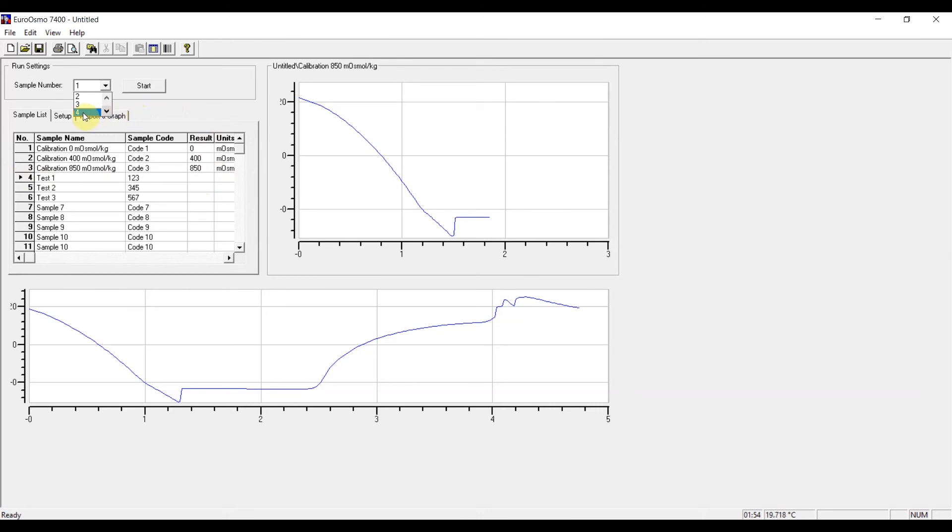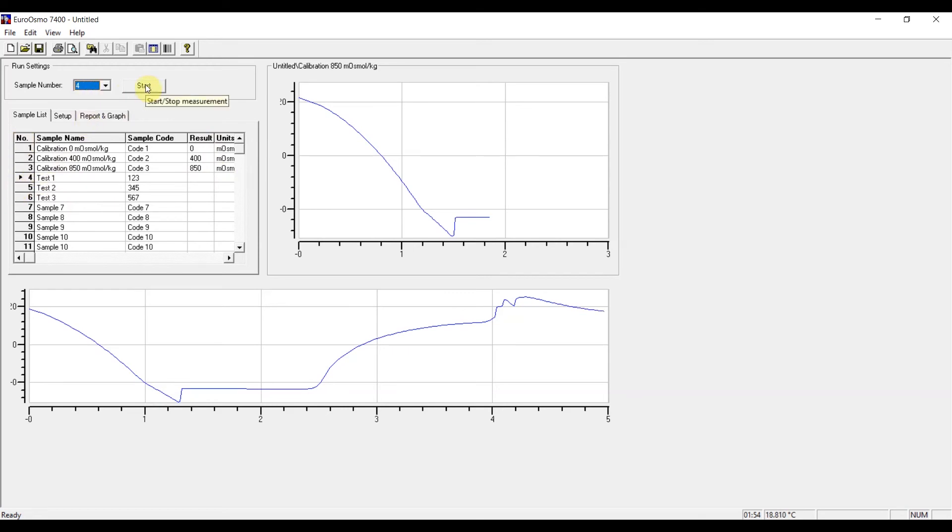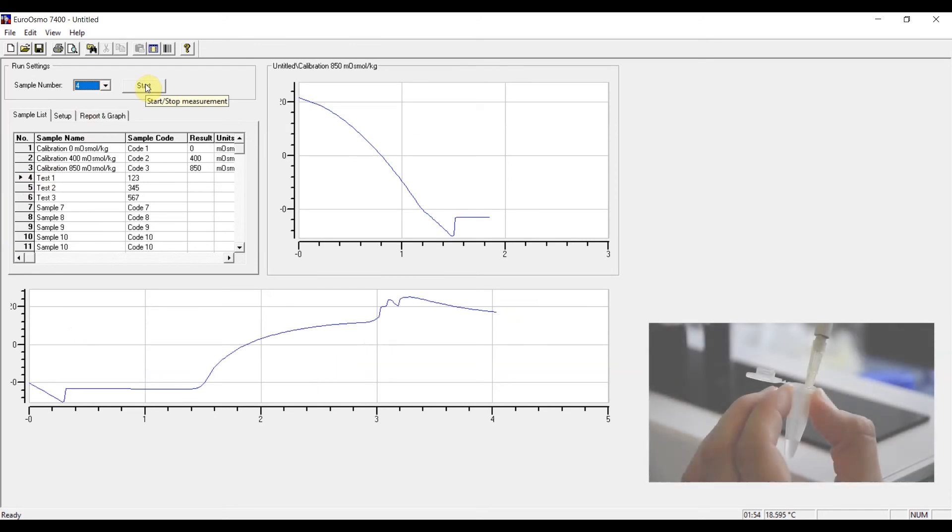So in this case, I'm going to measure test sample number one. So I chose sample number four, and here I press start and the measurement will start automatically.